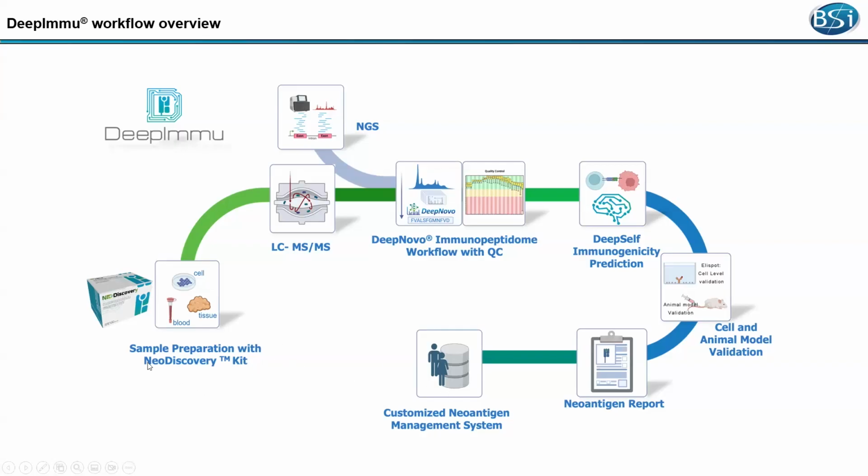We get your samples, do the immunoprecipitation purification of the MHC complexes, run the purified peptides in our instruments, do the analysis for you, and upon that we also do the DeepSelf immunogenicity prediction and generate a report for you.